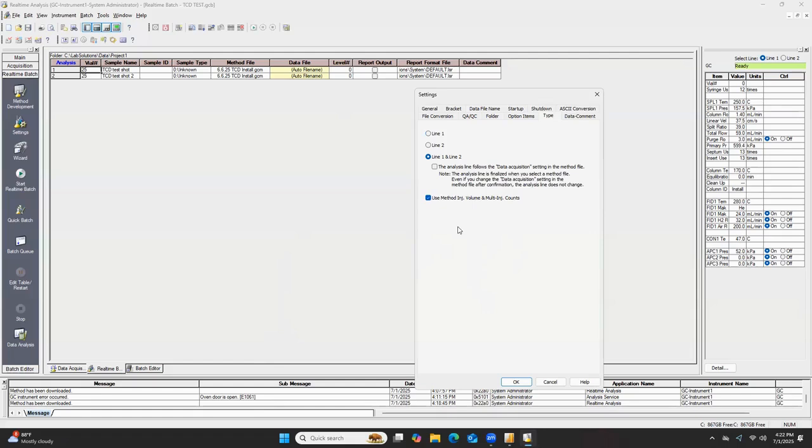It will get picked up by the first autosampler and injected to the FID, and then you would also have your TCD gas sample over here as well. That would be completely separate, because like I said, the flow paths for both of them do not touch each other.